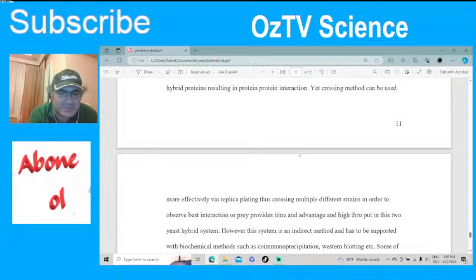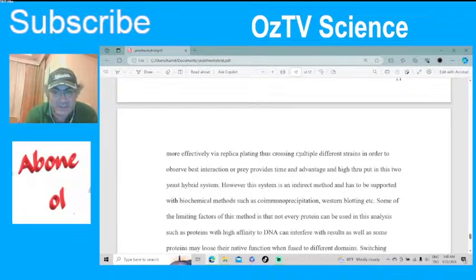Use the master plate as an ink, use the velvet block as a stamp, and then you can make many plates, 10 plates, 20 plates. Bam, bam, bam. So that should work better maybe, depending on your lab and depending on your protein. So it's a high throughput. So it's another way to do it.